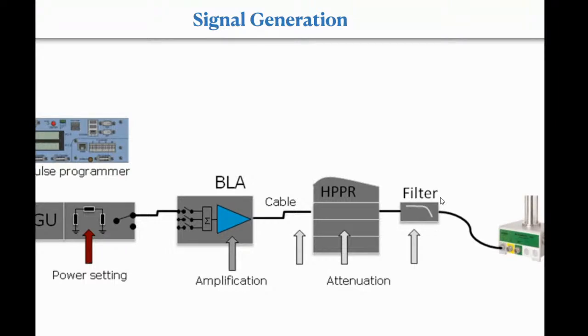Okay, so the receiver also comes through like that. The receiver signal goes to the top of the preamplifier, and then to one of the SGUs, not to the amplifier. It goes directly to the SGU called the DRU, digital receiver unit, which converts analog to digital. It has an analog to digital converter, which digitizes the signal. Digitized means it's points, no? It's zeros and ones. These points are then fed to a computer, and the computer then does the Fourier transform.